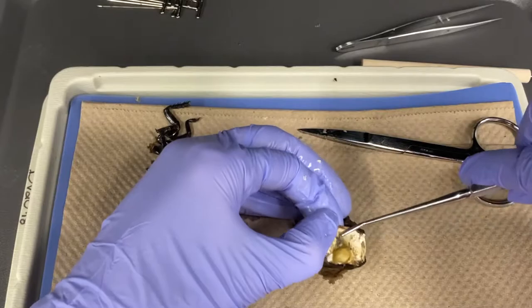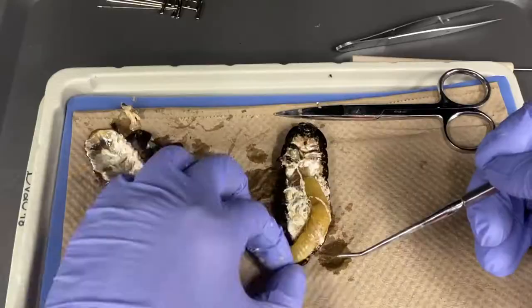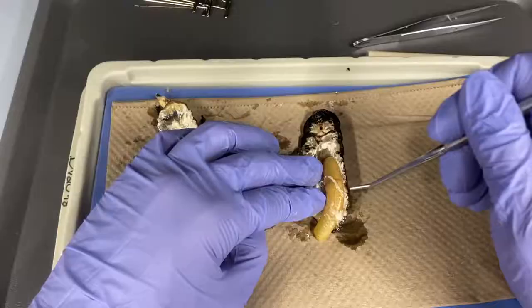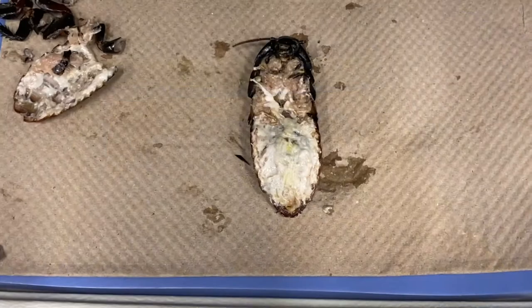If it is a female cockroach, you may see the ootheca containing yellowish eggs in the abdominal cavity. These cockroaches are ovoviviparous, meaning eggs are produced and hatched within the mother's body, allowing for added protection from the environment and predation. In order to view the rest of the internal anatomy, you will need to remove the ootheca before continuing with the dissection.